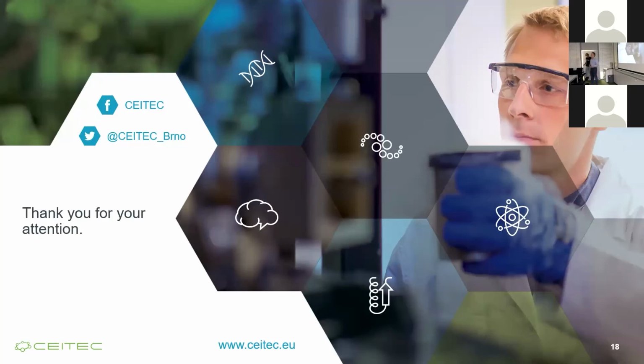I wanted to ask you, what is possible to do on the light sheet? What are the objectives? What are the possibilities to try on that microscope? Yeah, we have everything. We have objectives from 5x up to 20x, and there is zoom. These are water immersion objectives, so you can put everything; I think there's no limit. Most of the time, people have organoids or roots or plants. You put them in agar, or just stick them on some holder, and you image it. So it's difficult to say if there is some limitation.